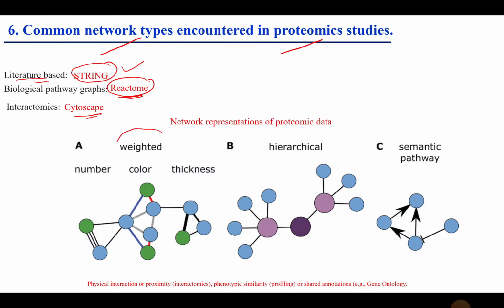Like here you can see in this weighted network interaction, each protein is connected with many other nodes. There is no exact central node, and each node is connected with many other different proteins, so it is almost impossible to tell which protein will act as a central part of the interaction.